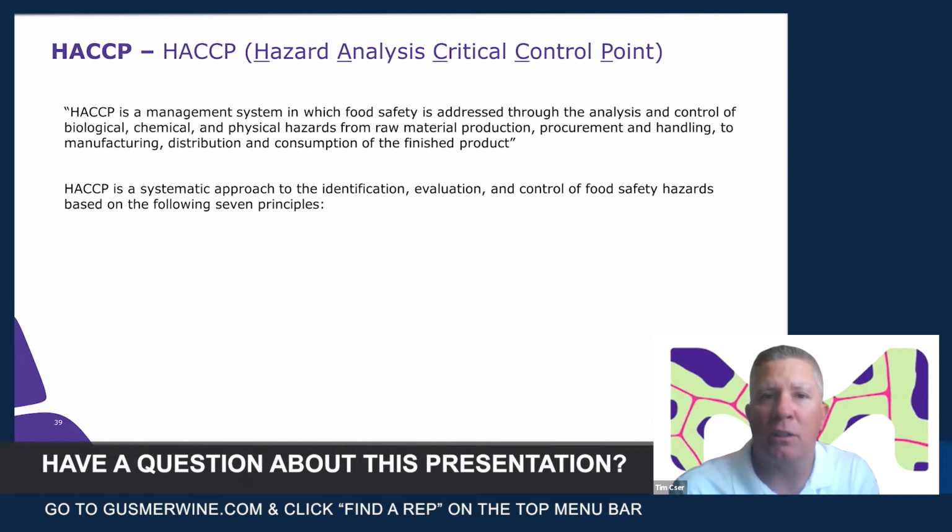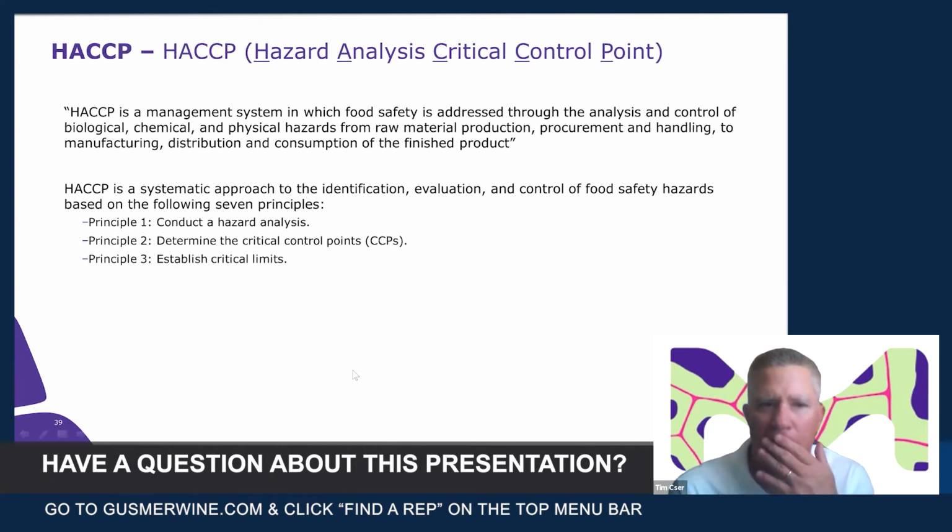Wherever you feel like there's a possibility of contamination in that facility, or a possibility where there's debris left over that could cause contamination, you want to evaluate your process and look for those points. So next slide, I think I'm just going to go through all these.